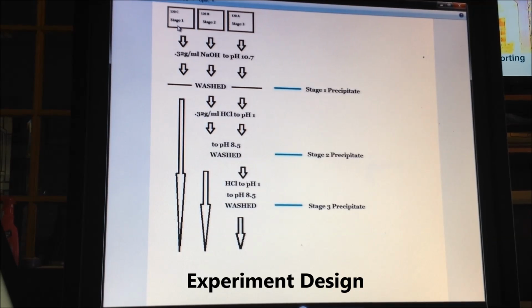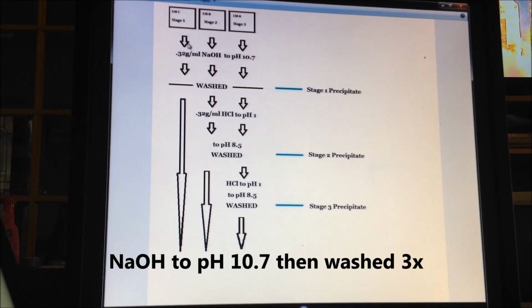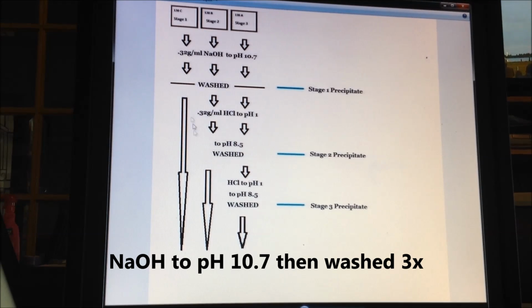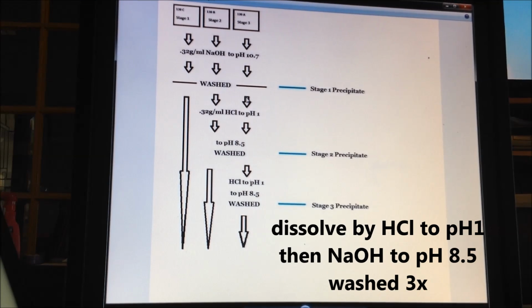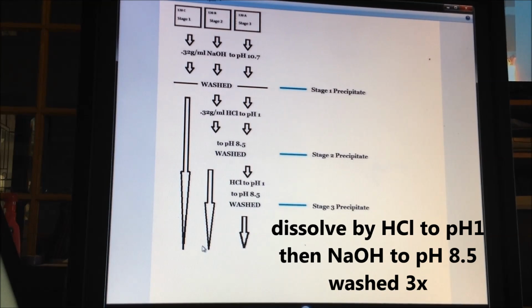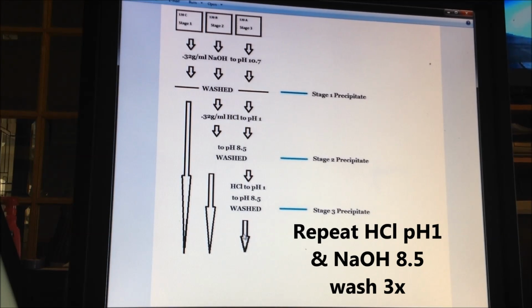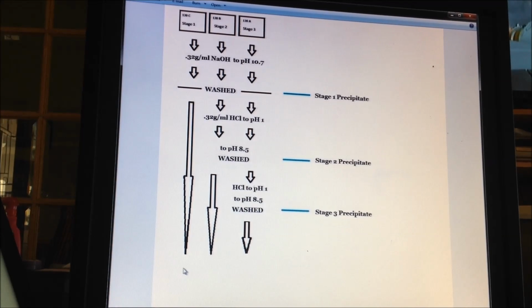Well, here's the plan. We've got 3 samples. The first one stopping at the first stage of precipitation, so it would come all the way through. The second one and the third one going on to a second stage of precipitation, and then that one following all the way through, and lastly one going back to pH 1 again for a third stage precipitation. All standard sort of stuff. The idea was that we could then compare the Ormus from each of those 3 stages.